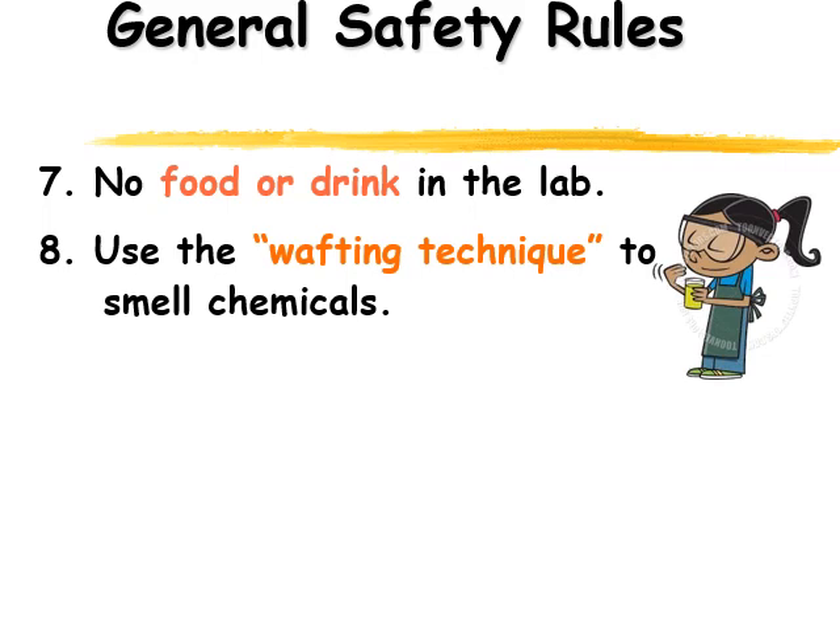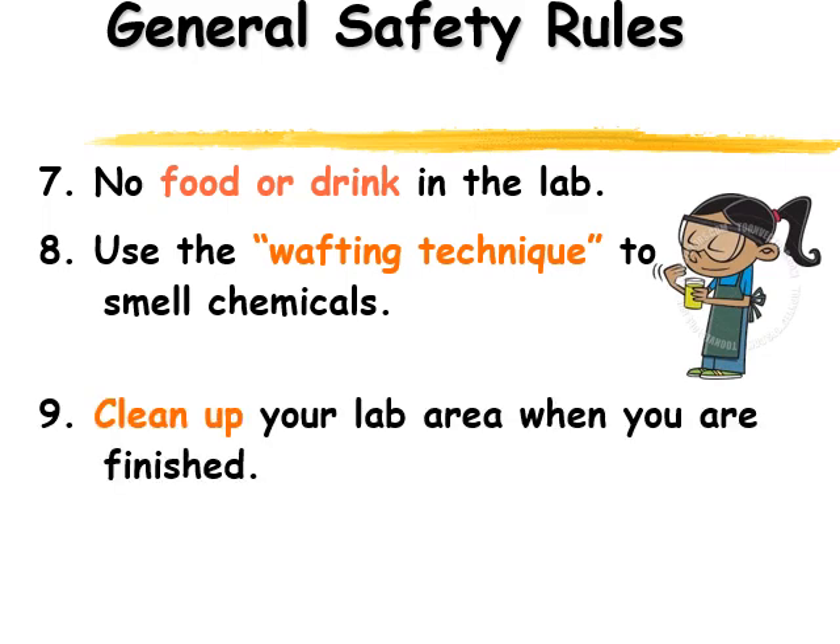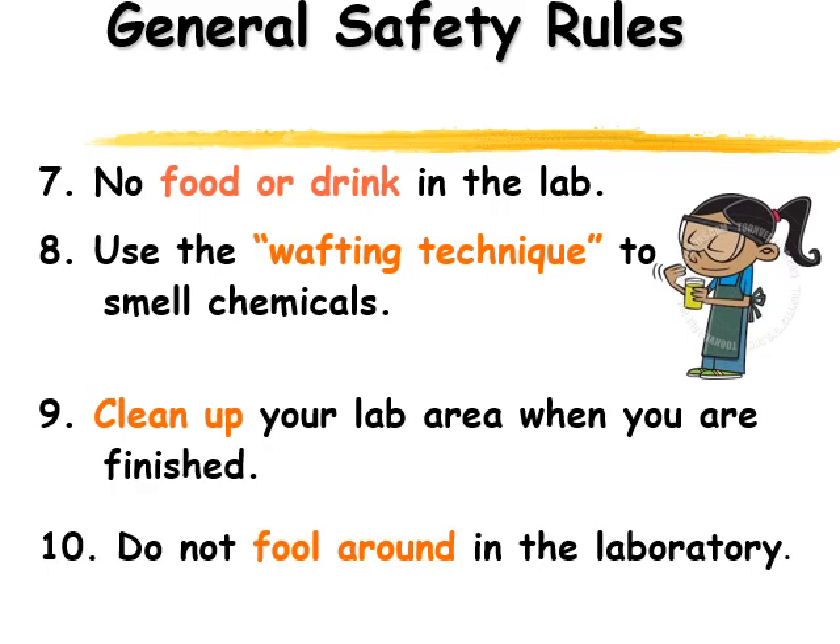When you're finished with your lab activity, make sure you clean up your work area. Wash off the surface of your desk if there are dangerous chemicals around so that we leave the area nice and clear for the next person. Finally, we're going to make sure we're working safely and not fooling around in the laboratory. So those are our top ten rules, and we'll tell you other safety rules as we go through doing labs.